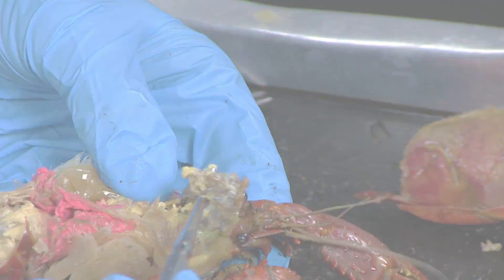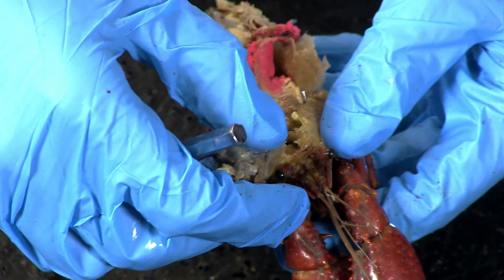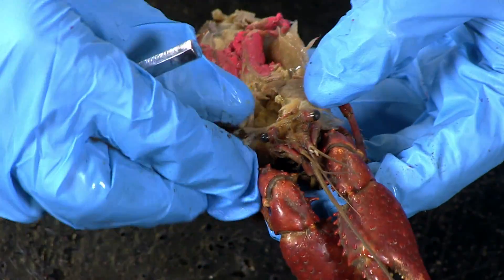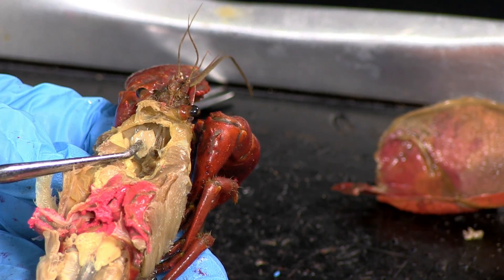Take a picture and label the stomach. Locate the green antennal glands anterior to the stomach at the base of the antenna. These are primitive excretory organs that remove metabolic waste and excess water. Take a picture and label the green glands.